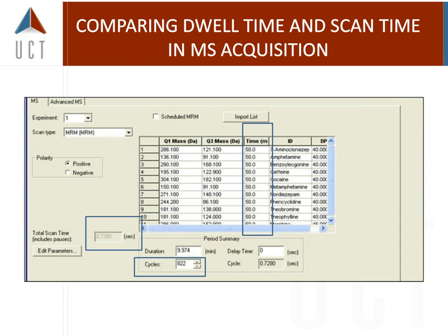If you don't have your instrument optimized to your particular group of analytes, you may not get a signal, and that could be, and sometimes is, attributed to the solid phase extraction or the sample preparation, and that is not necessarily always the case. So what I'm going to do just very briefly now is tell you a few tricks that basically will help you to optimize some of your system.